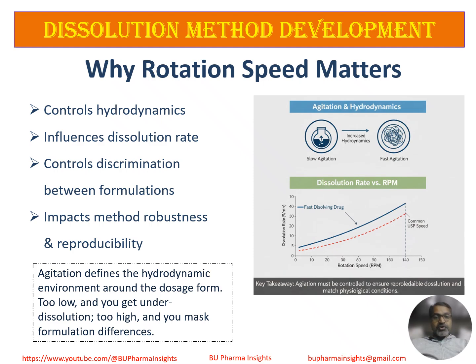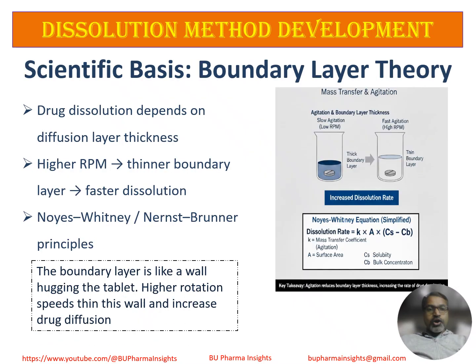It controls hydrodynamics, influences dissolution rate, determines discrimination between formulations, and impacts method robustness and reproducibility. Right RPM means meaningful dissolution data. Rotation speed directly links to dissolution kinetics.